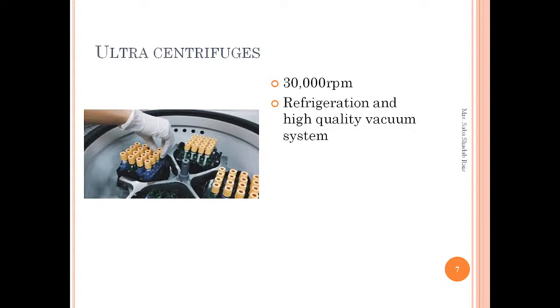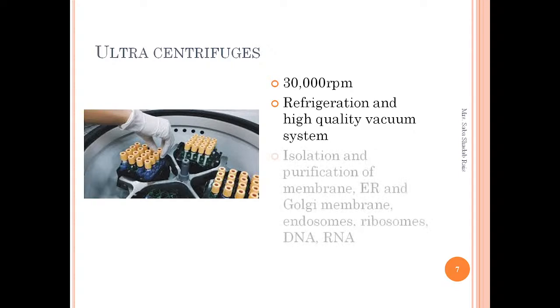They are used now. Where do we use them? In such a more complicated system, for example, you want to separate the cellular components, like the Golgi apparatus, endoplasmic reticulum, endosome, ribosome, DNA, RNA, such complicated things you want to separate.